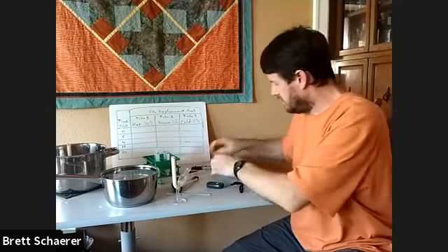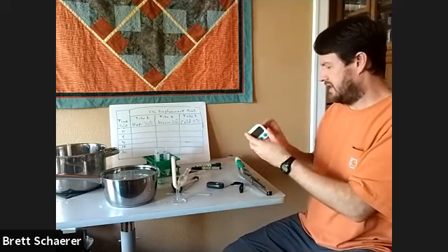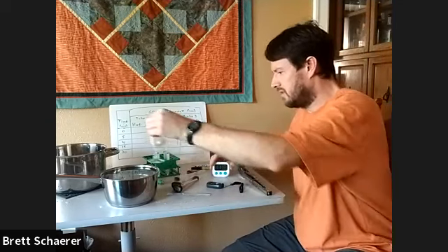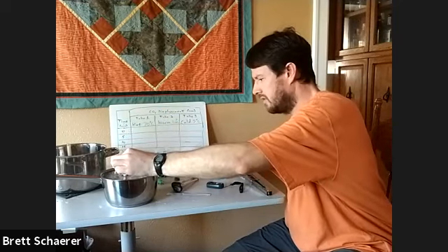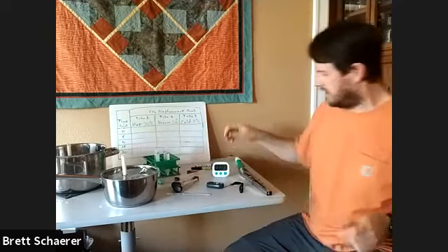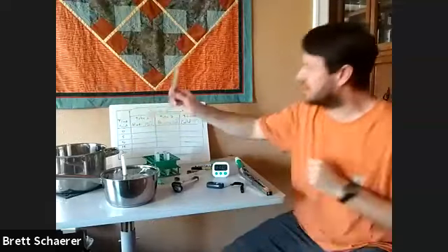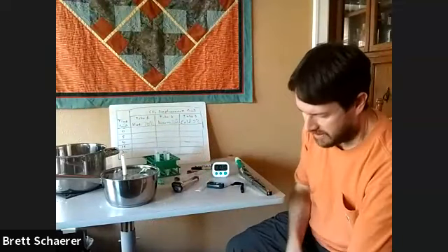I think here I'm going to call this time 0. Measure the... Yeah, it looks like it's still marked in the pot.